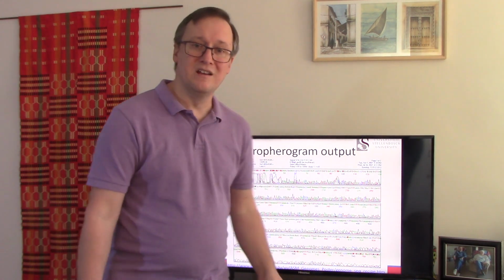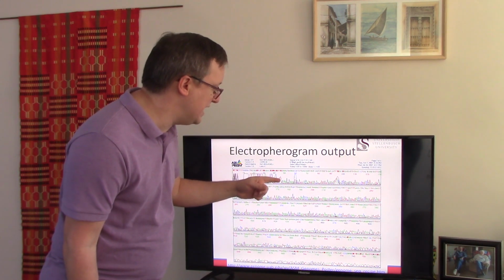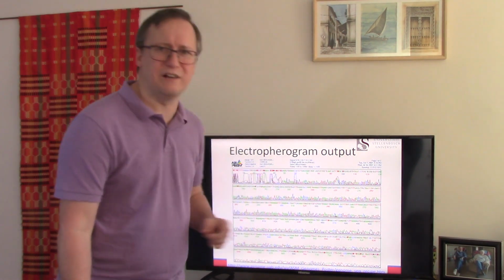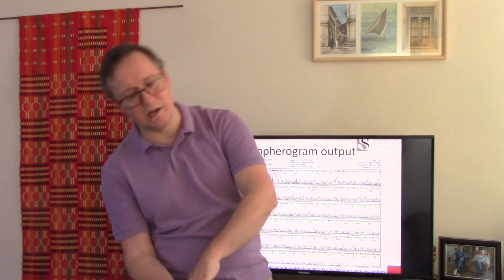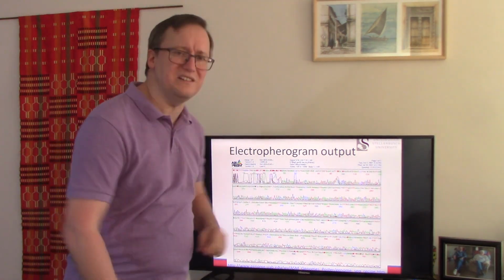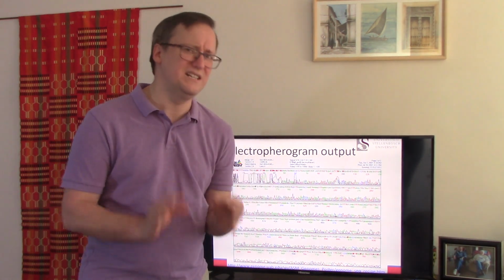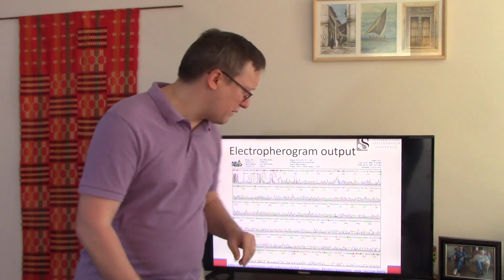That's easy. But look at some of the stuff that appears up here. In this region below 50, we have some red peaks, which would make us think that they are T's. But you'll note that they aren't baseline resolved. It doesn't go all the way up to the top and then fall all the way back down to the baseline and then rise back up again and then fall back down again. So when we get to areas that are poorly resolved, it gets very difficult not only to say what letter is at that position, but how many are there in a row.